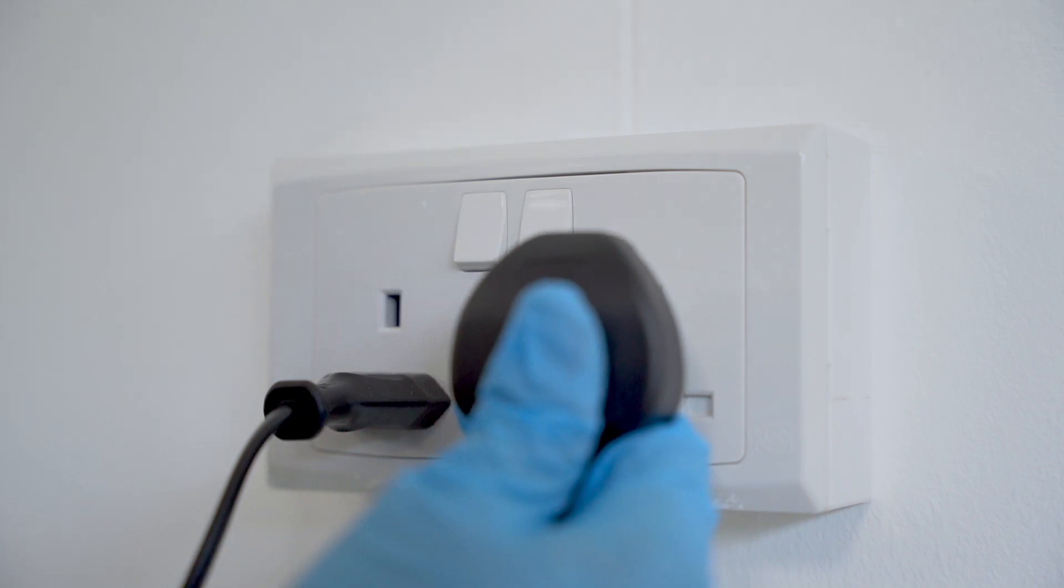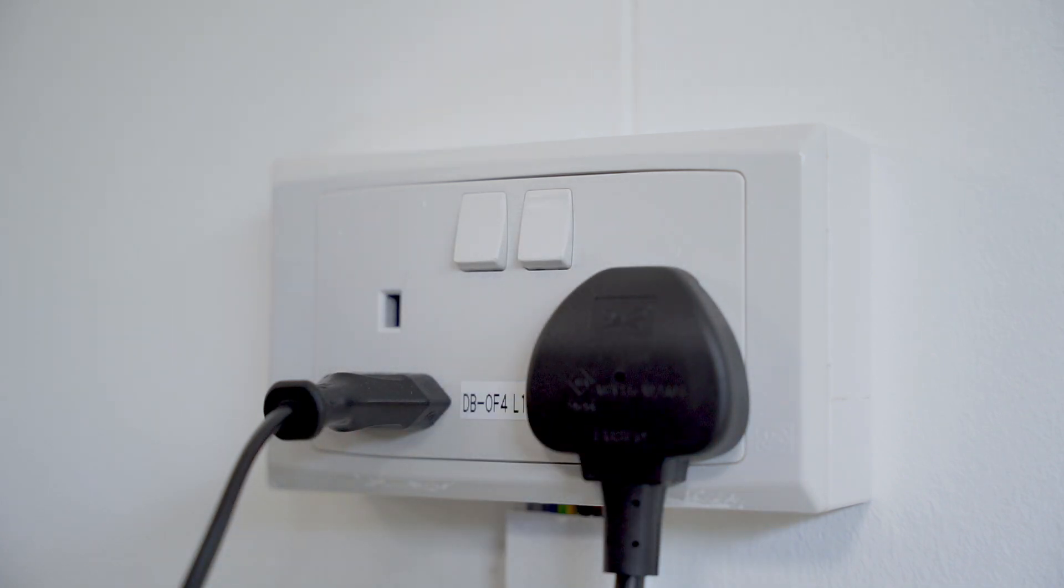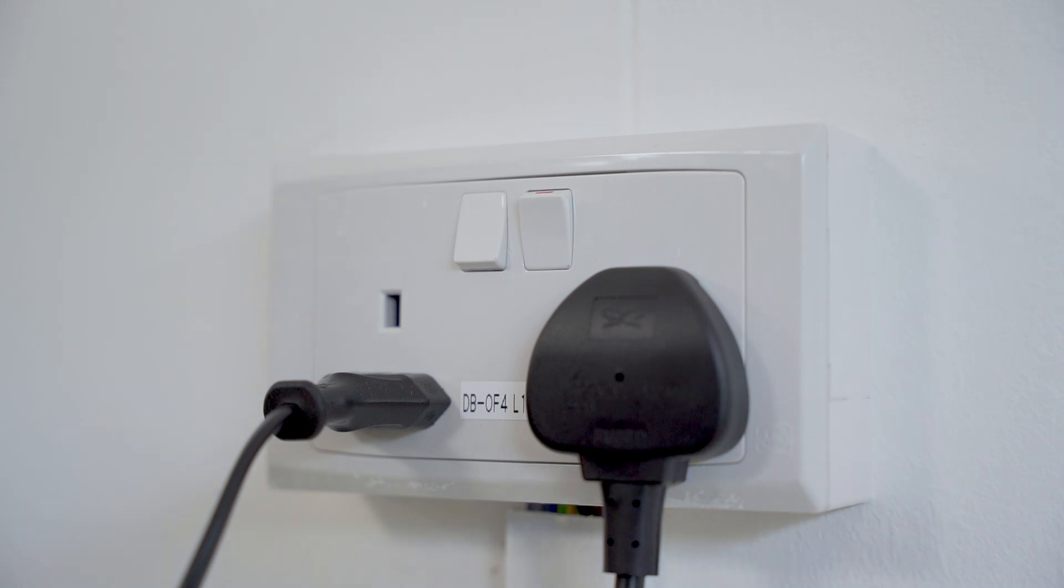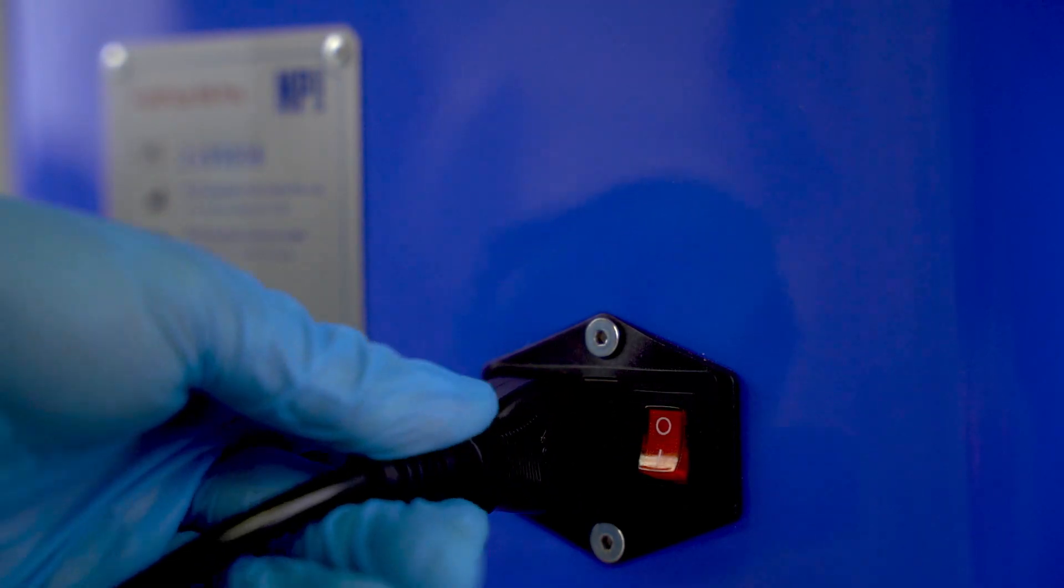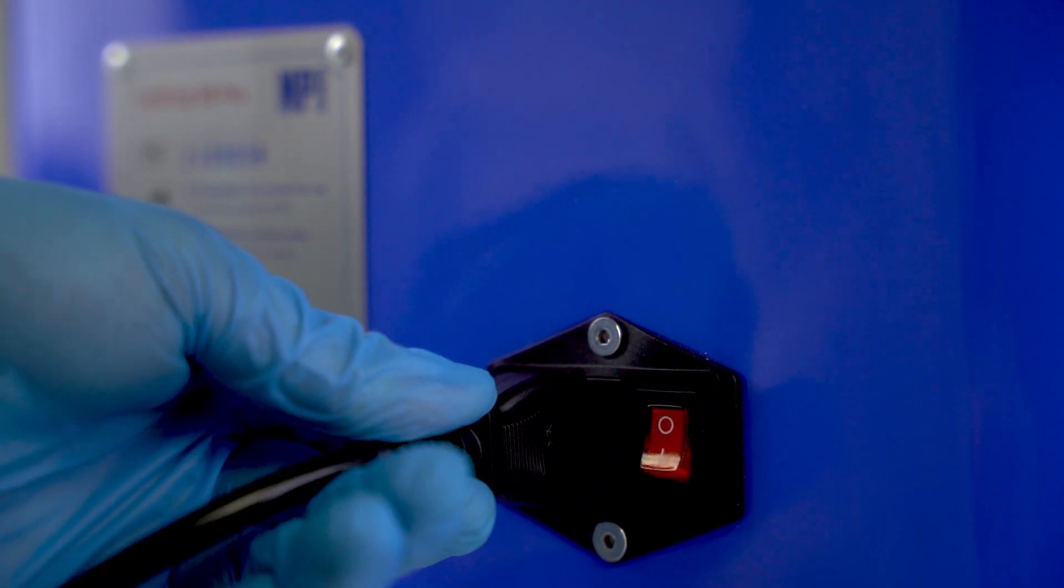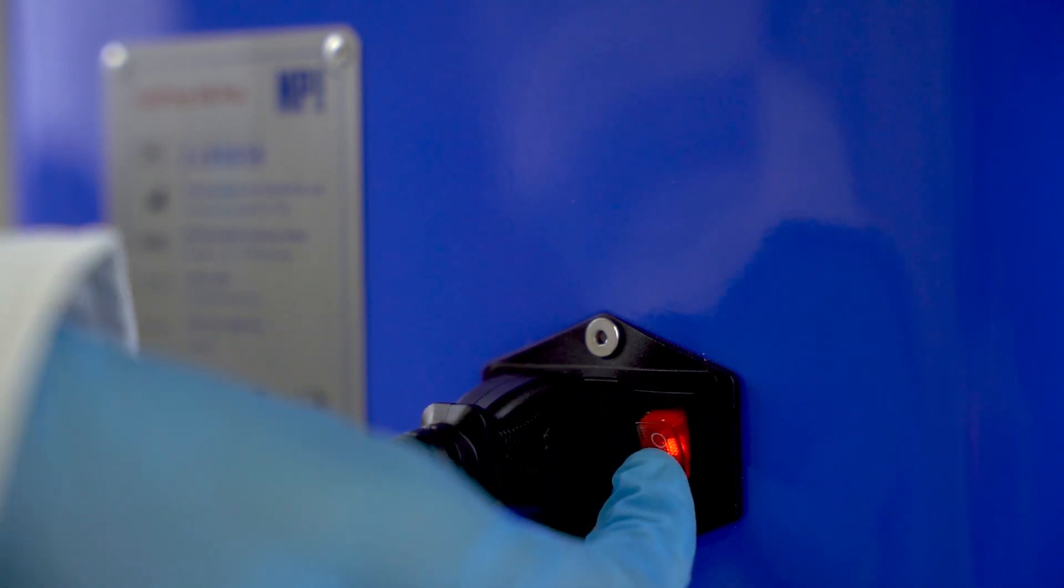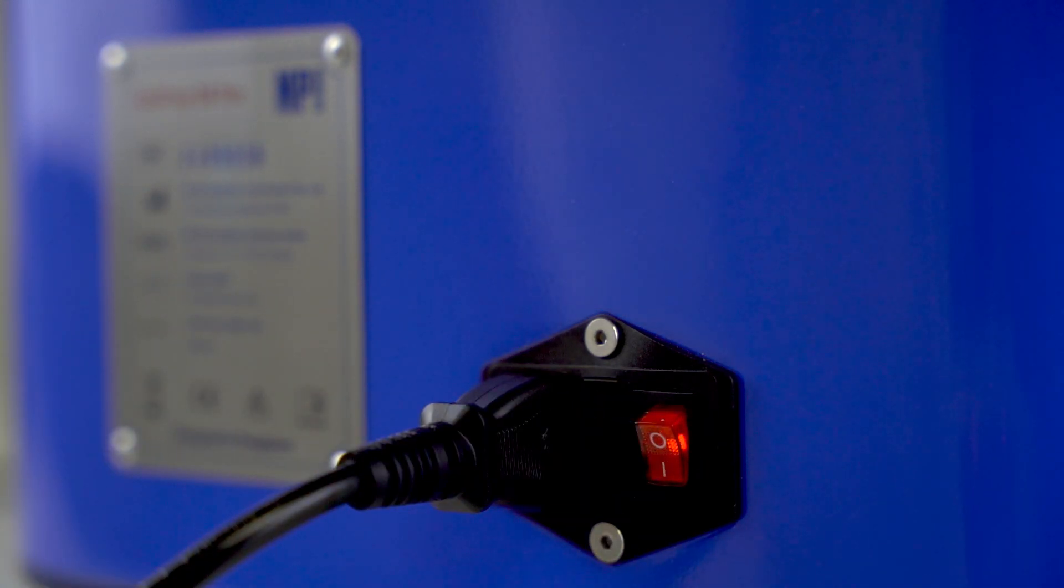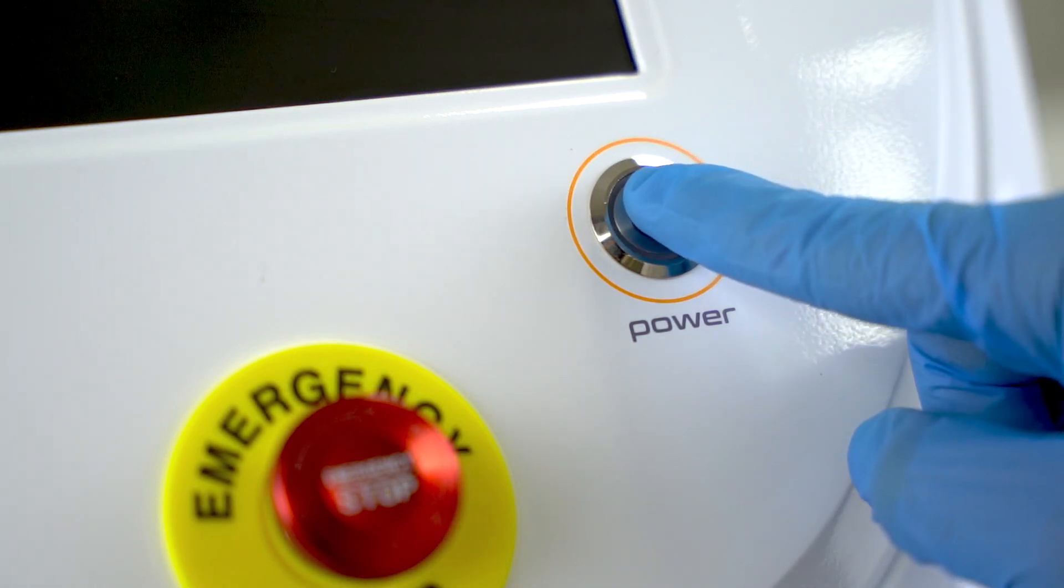Select the correct plug type for your region and attach it to the power cord. Ensure the plug is securely fitted to prevent power issues. Once connected, turn on the power switch at the back of the machine. The red light on the switch should illuminate, indicating the machine is powered on. Press the front power button to activate the machine's interface.